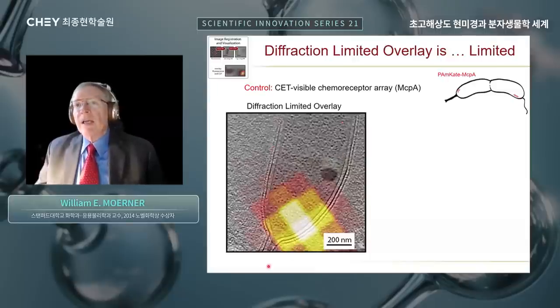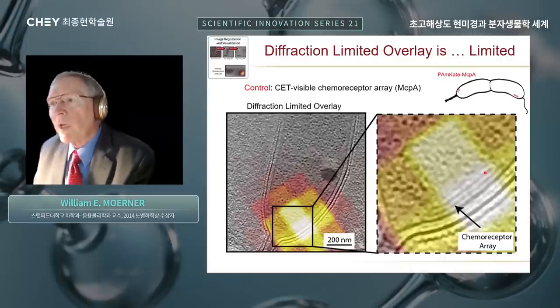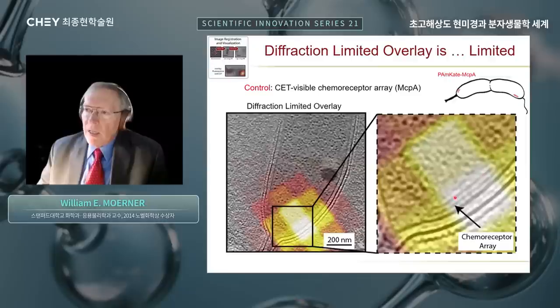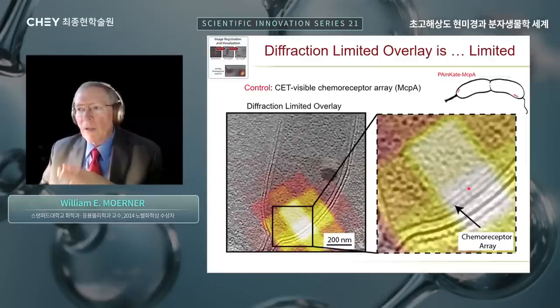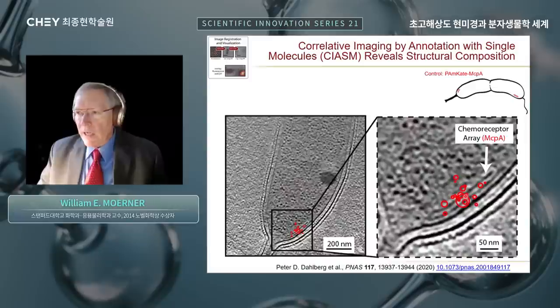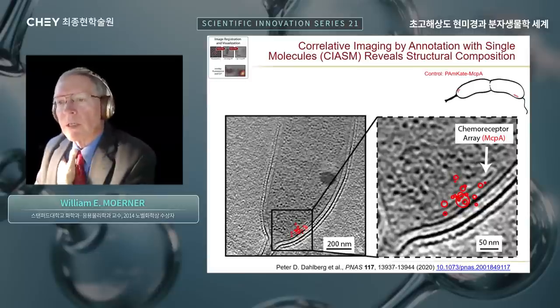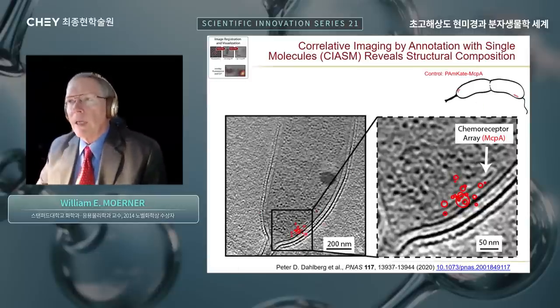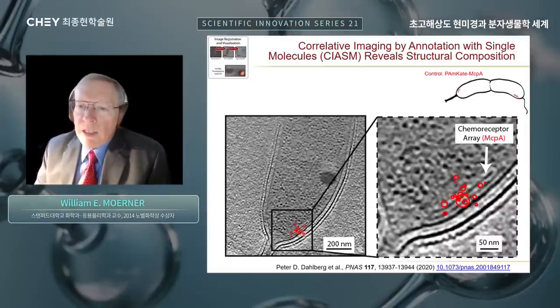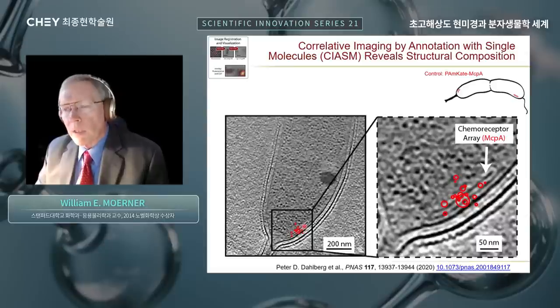Here in the lower left is a cryo-electron tomogram image of the cell, where if you didn't have anything more than diffraction-limited fluorescence microscopy, you could only place a blob of light on top of this cell. And you can see by blowing it up that this is a pretty good control cell, because these two lines represent the chemotaxis array. They actually show on edge two plates of the chemotaxis array in these cells. So switching to single molecule localizations now, instead of diffraction limited images, we see this sort of data from these experiments. Now, what I'm showing you is a selection of the single molecules that were found of the PAmKate-MCPA. And they're being shown as these little red circles. Now, why are we using red circles? Well, it's to emphasize that each of these circles is the data from one molecule, a single molecule.